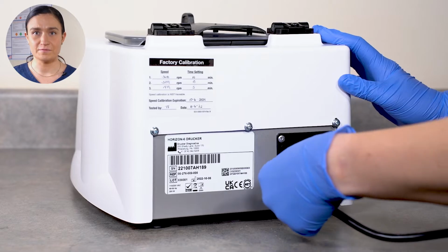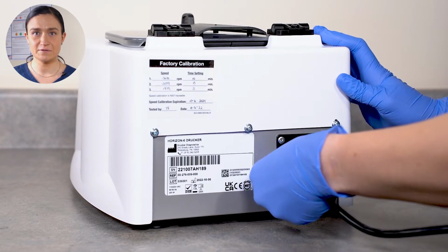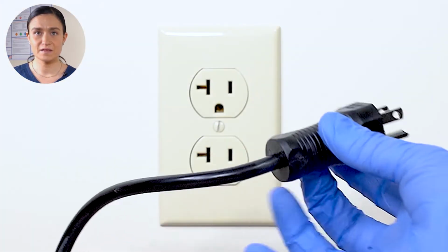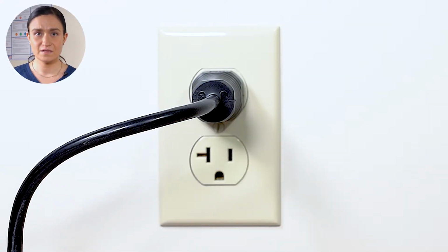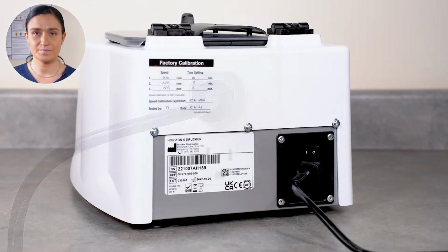Locate the power cord that was included in the accessories kit when you unpacked your Horizon 6. Plug it into the back of your centrifuge and then into the wall. Make sure your outlet is easily accessible so you can unplug your centrifuge for cleaning and maintenance.